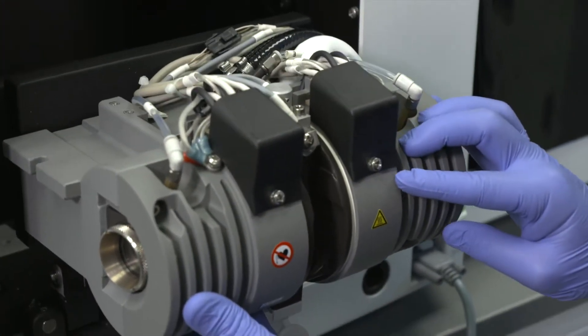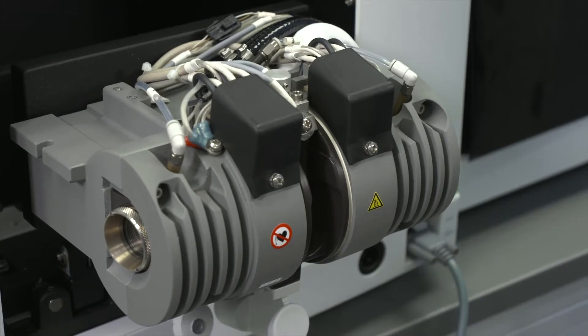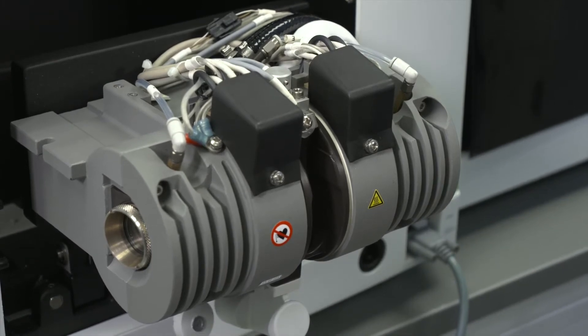The first step will be removing the previous contacts and tilting the graphite furnace forward so that the cylinders are accessible. Refer to my previous video on how to remove the contacts.